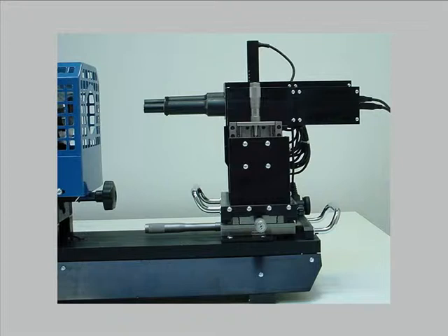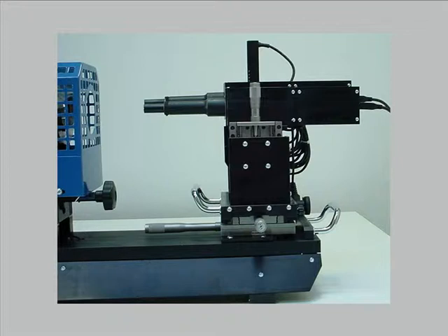The two microscopes are mounted on micrometric slides which allow the precise positioning of the microscope to frame the top border of the sample and the sample holding plate. The upper optical path is equipped with a step motor which keeps the microscope always aligned with the top of the sample, even if the linear shrinkage overcomes 50%.